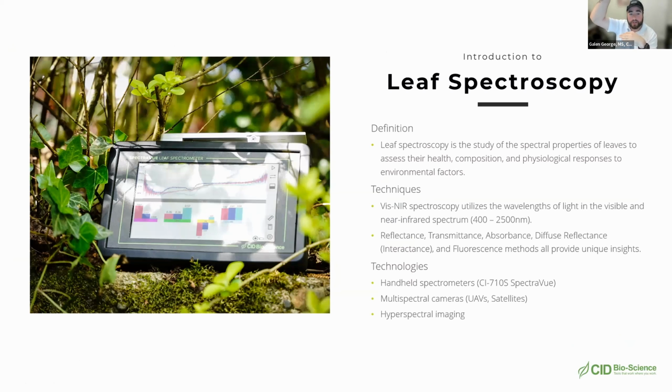And so the lamp that's in that arm and then the detector and lamp that are in the actual bottom of the device will both be able to penetrate light through there in a completely closed environment. So there's no light seeping in. Even with a really thick leaf, you're still going to have that closed environment as long as that leaf is covering that entire optical window.